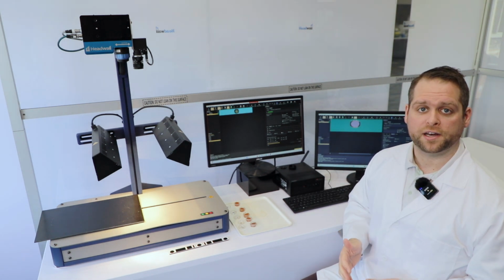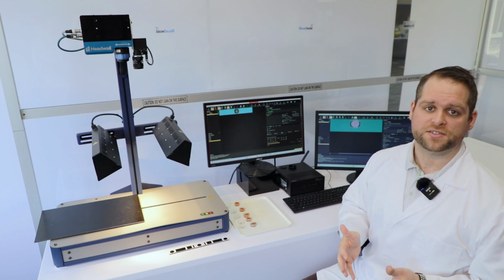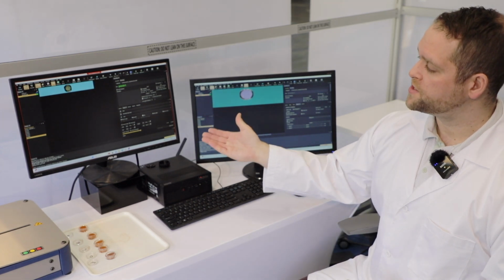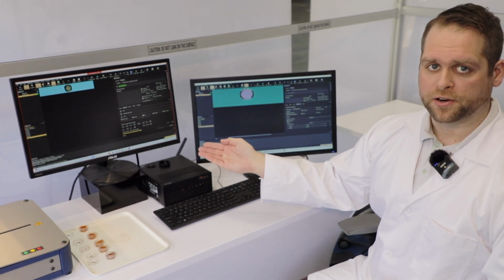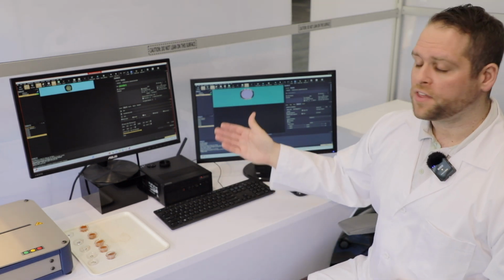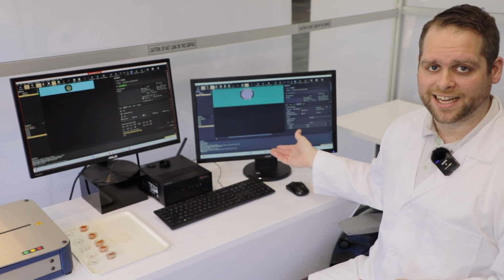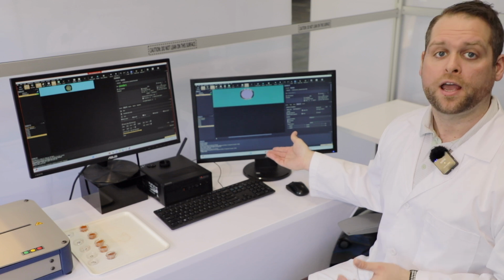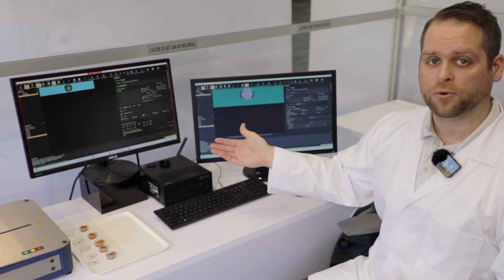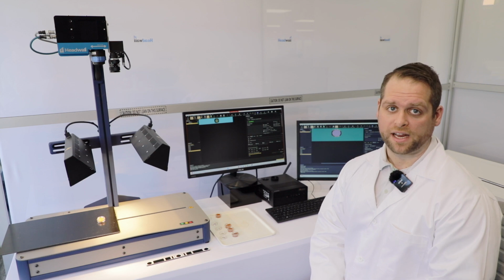Before data collection, we've created a simple classification model which is able to detect any powdered substance that contains a percentage of cayenne pepper. To start, we initialized the MVC NIR within the Perclass MIRA system and then calibrated it, collecting a white and dark reference. We then can create a worker instance of Perclass MIRA where we're able to initialize a second camera, in this case the MVC VNIR, and we also calibrated that instrument with a white and dark reference similarly. We then created that simple classifier to identify the powdered samples. Now we're ready to collect some data.